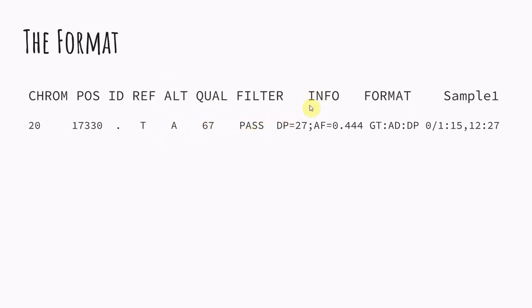So here in the info field we see this DP. So this is like the total depth at that specific site. So we had 27 reads at this site and this AF is allele frequency. So 44% of our reads supported this variant. And then the format is given in this kind of notation here. Each of these stands for something. So this is genotype. This is allele depth. And then this is like total depth.